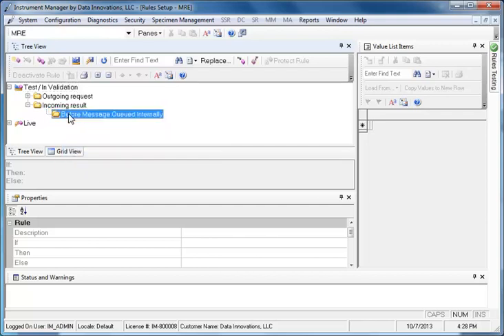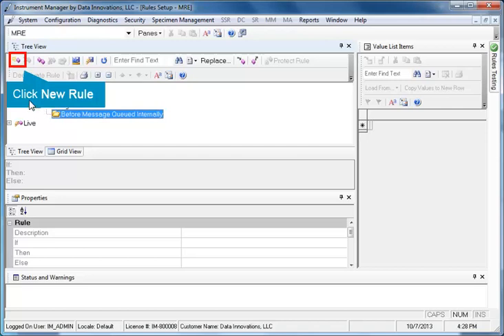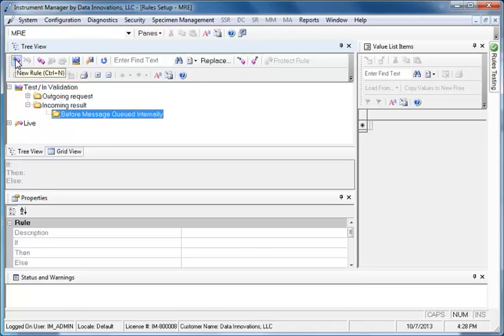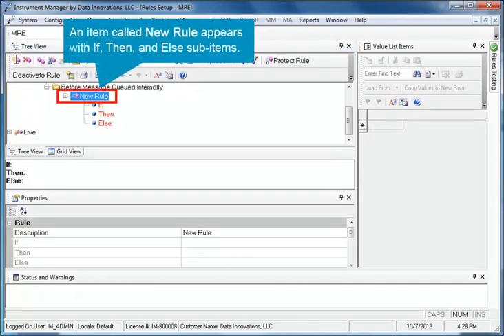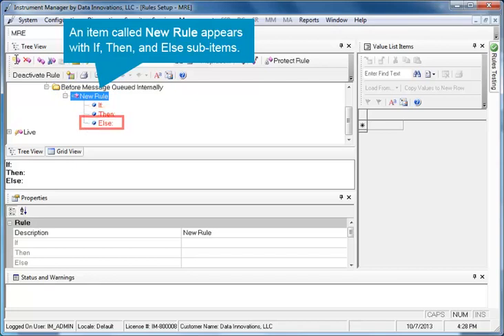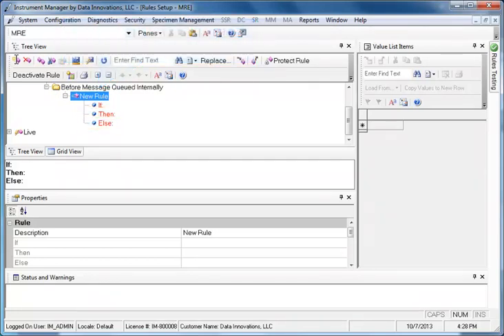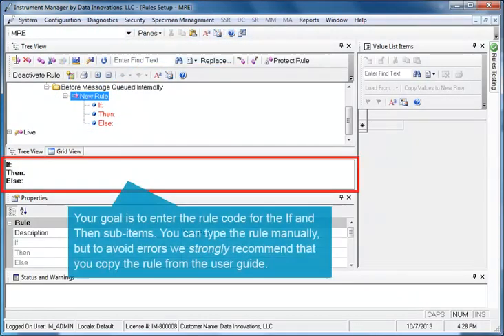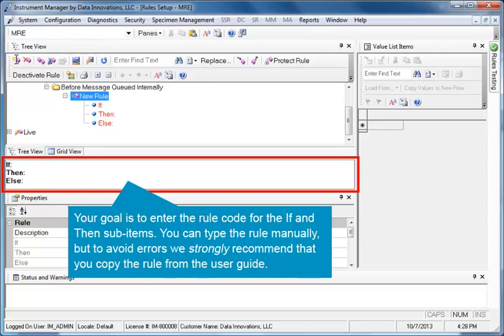To create a new rule, click the New Rule icon in the toolbar. An item called New Rule appears with If, Then, and Else sub-items. Your goal is to enter the rule code for the If and Then sub-items in the box below the tree view. You can type the rule manually, but to avoid errors, we strongly recommend that you copy the rule from the User Guide.